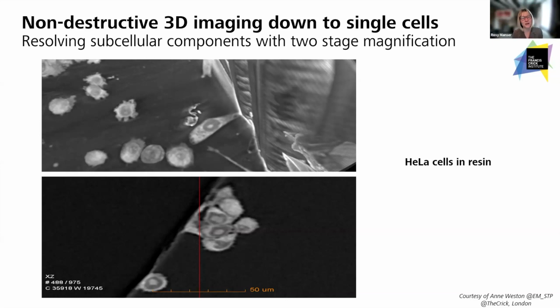But just to give you an idea of scale, you can look at single cells or subcellular, and you can look at things as big as footballs. So this is a technology which is extremely varied in terms of the sample type that you can place inside it.